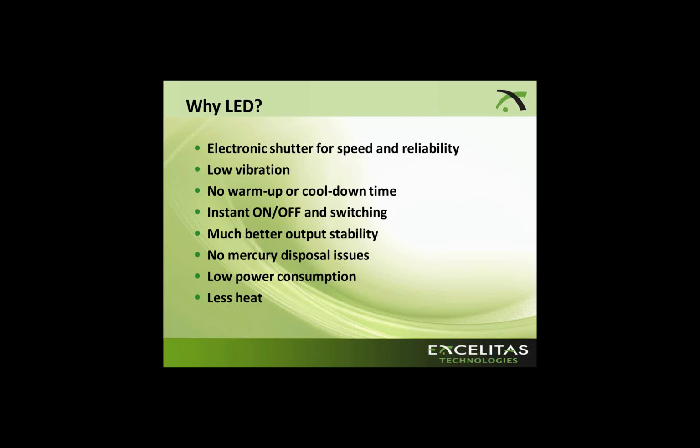And this also enables you to image faster and also turn on and off whenever you want to, not expose your sample to light. LEDs have lower vibration in most of the instruments. Like I said, there's no warm-up or cool-down time. You simply turn it off or turn it on. The output stability is much better than lamps, and I hope to go through a little more of that in the next few slides. There is no mercury, so there's no mercury disposal issues, and a lot of labs are going green, and they do not want to deal with the mercury disposal, so they are quite happy with the invention of LED for microscopy.